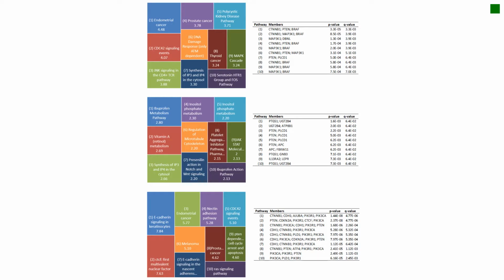Here is just an example of the graph that I have plotted for the R273, R175 and also NS. What I did is I represented it in a tree map so that the reader can look at each of the pathways more clearly.